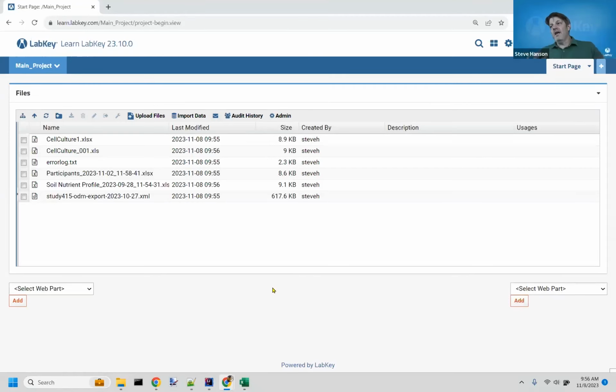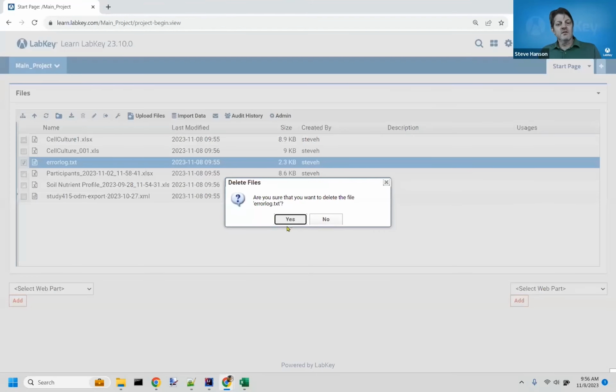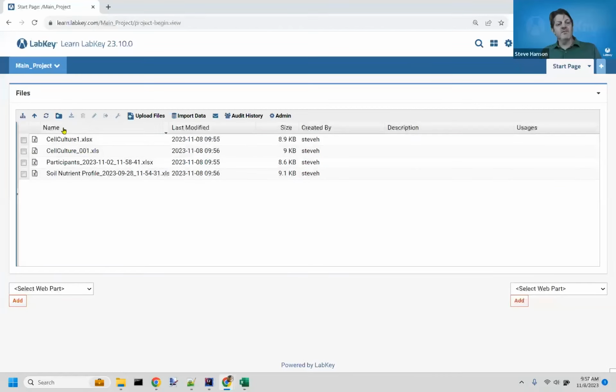Now I already have an app, essentially. I could now reveal this to the world and people could interact with it. They could download stuff from it and whatnot. And in fact, I'm going to take this error log out because that's from a client, and I kind of regret putting it there. I don't think we want to show that to the world. But the rest of all this stuff is data I invented out of my imagination. I'm going to open this to the world.